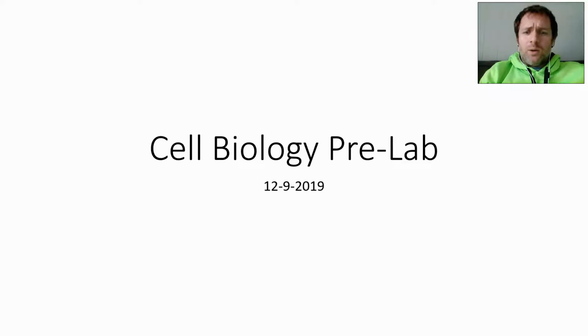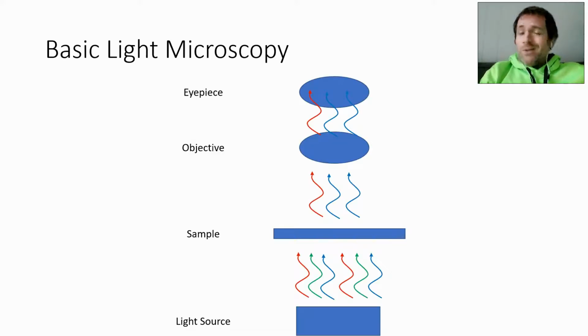Hi everyone, we're going to go over our pre-lab material in this video real quick. Hopefully it'll smooth things out for tomorrow. I just want to go over how microscopy works.